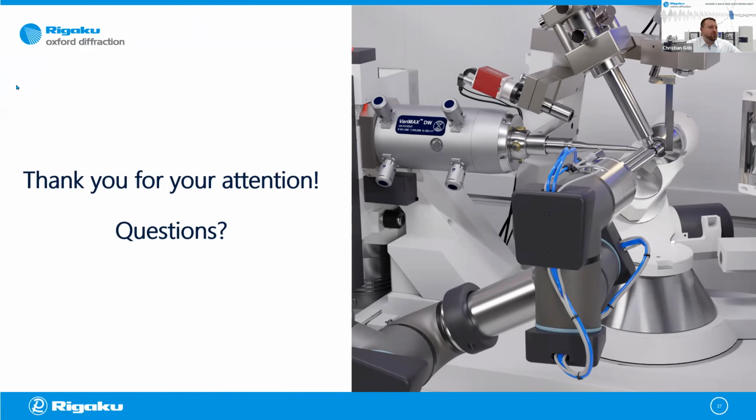So the standard soaking protocol could be that you have your 1 to 2 micrograms of analyte per crystal sponge sitting in 50 microliters of cyclohexane or n-hexane. And from here you can start. I would not go higher with the concentration or amount of analyte. That's not necessary. You can play a little with temperature and with concentration for the soaking and soaking time.